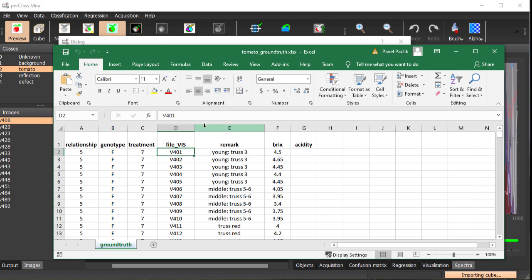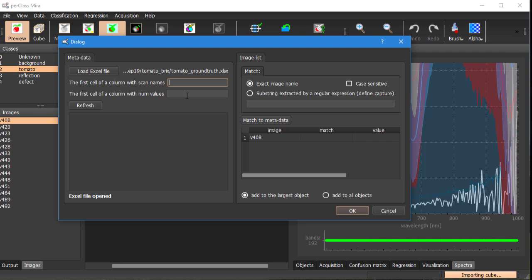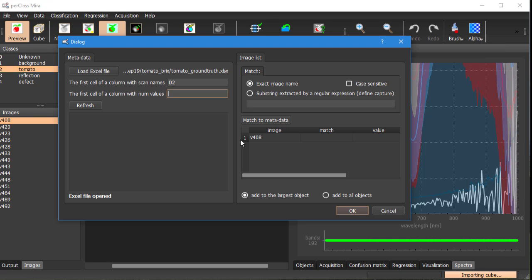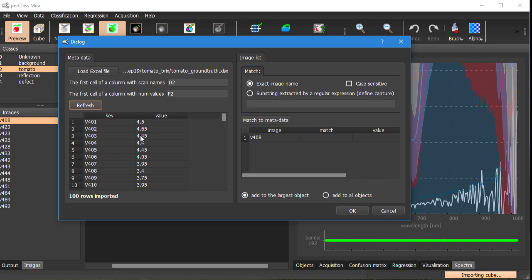So scan names are in column D and the first cell is D2, and numerical values are in column F and the first cell is F2. Then we can load values from this file.